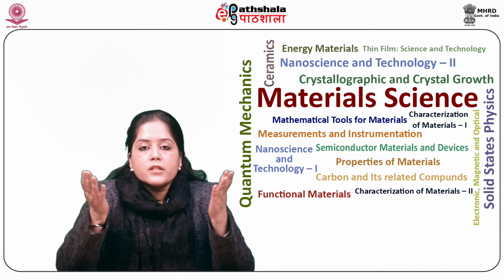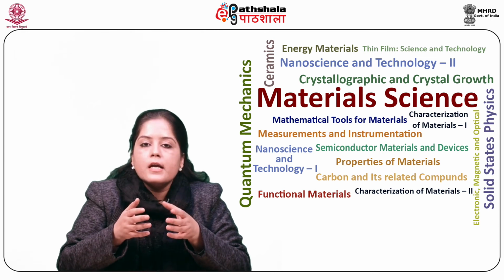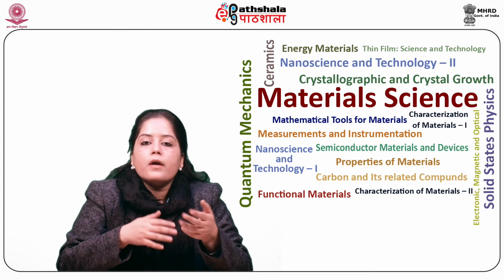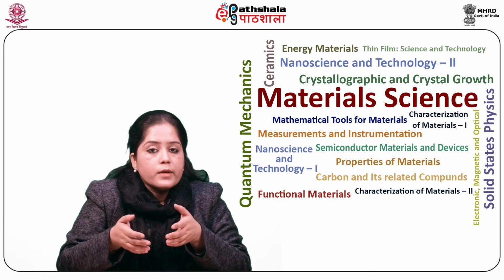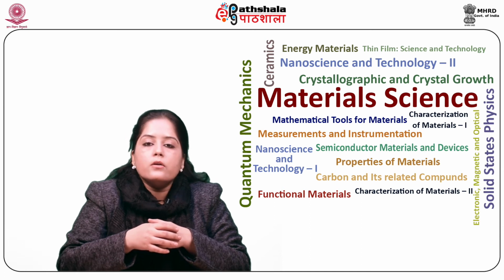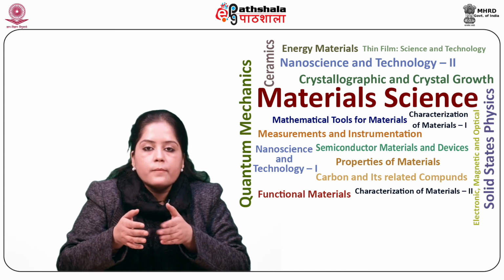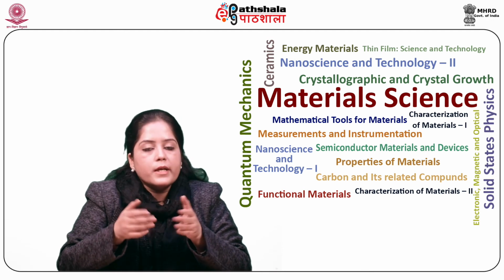include the local characterizations of electromechanical properties of materials, including detailed domain mapping and study of domain switching dynamics, testing of micro and nano electromechanical devices, for example, piezoelectric actuators, transducers, and MEMS, electro-optical devices, and non-volatile memories components, that is FeRAM devices, addressing their reliability issues such as electromechanical imprint, fatigue, and dielectric breakdown.